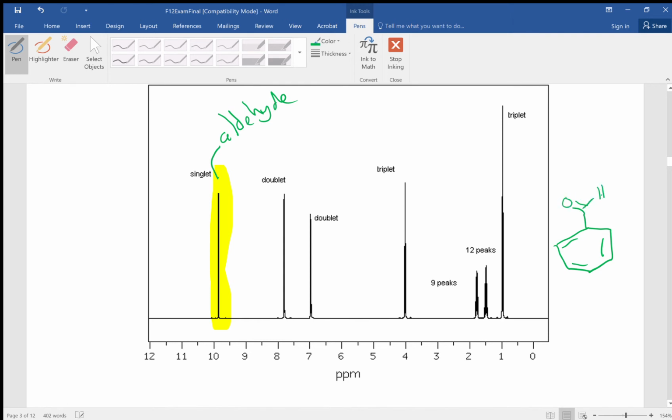Now I'm going to again put that aldehyde right on the aromatic ring, because at 1695 wave numbers, we know that that aldehyde has to have some sort of conjugation. Now, what else do I see? The next thing that gets my attention are these 2 doublets. Remember, anytime we have 2 doublets like this in the aromatic region, first of all, it confirms that we have an aromatic ring. Second thing is it tells us that we have this 1,4 or para type substitution.